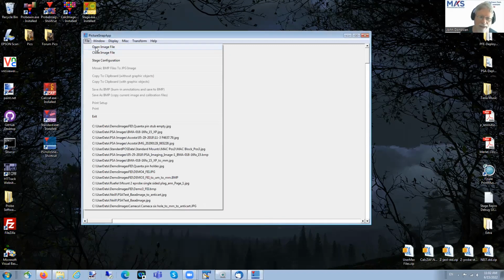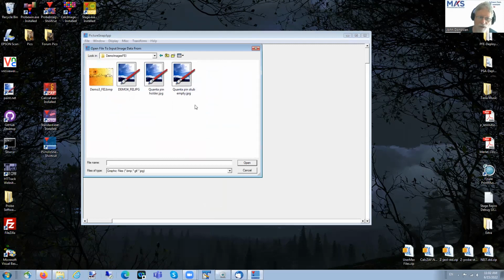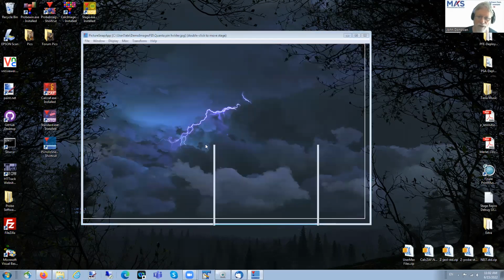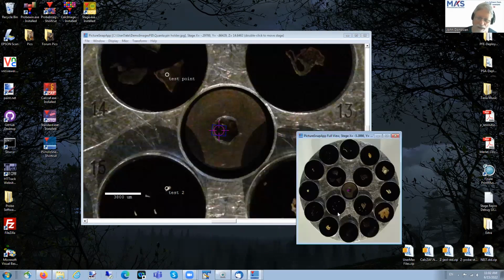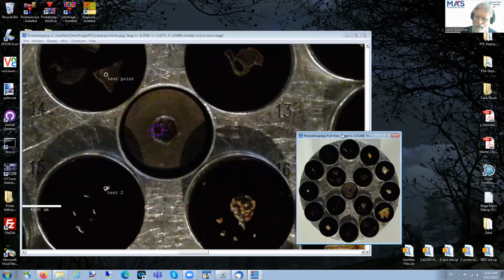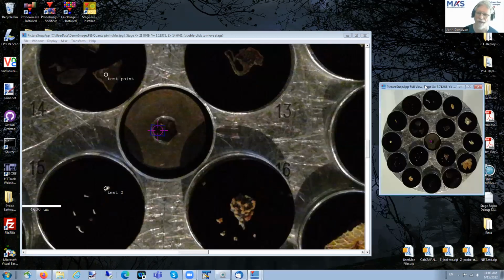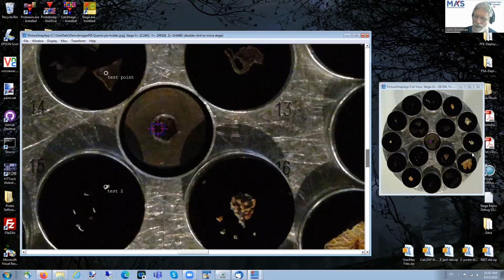So let's open up an image, and it'll put you into this user data folder as usual, and then you go to, like, say, FEI instruments, and I'll just choose maybe this one here. Because I'm in millimeter units, it opens it up in millimeters. It doesn't have to do any transformation. And so the main window is always a 1-to-1 pixel mapping, and it can handle almost any size images. I think it'll handle up to 32,000 by 32,000 pixels. So some very large images can be loaded here. And of course, you can scroll to see the whole thing, but there's also a full view there.